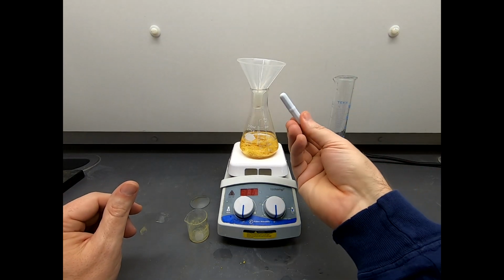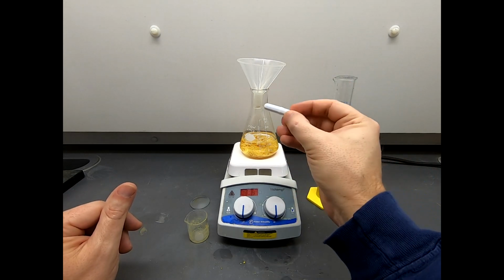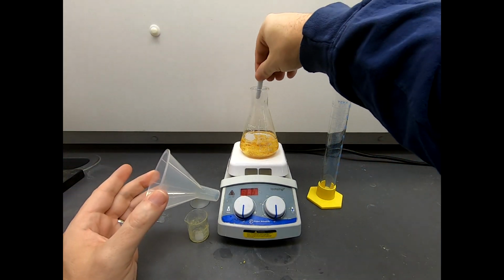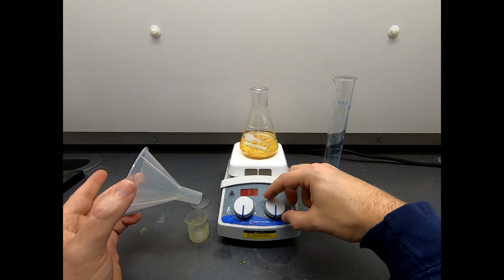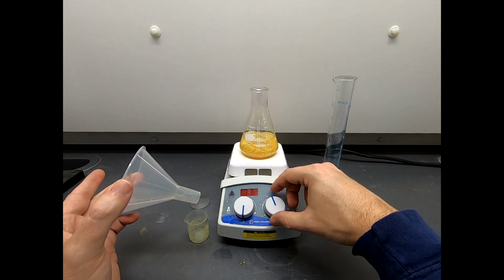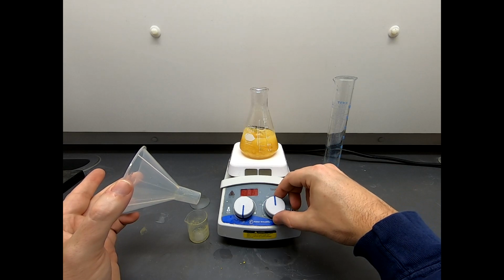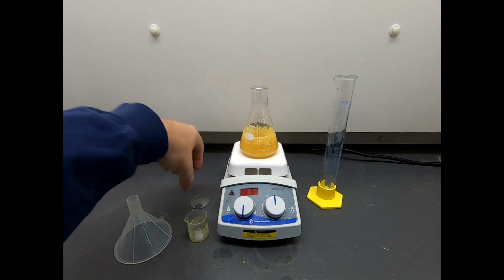Now to this, I'm going to add this big stir bar. This is kind of an overkill stir bar, but I really want this to stir and mix and hopefully break up any chunks in here. So let's add this down. That's fine. And now we want this to stir. Let's get this going pretty good. I may turn it up a bit. Now I'm going to let this stir for a while.